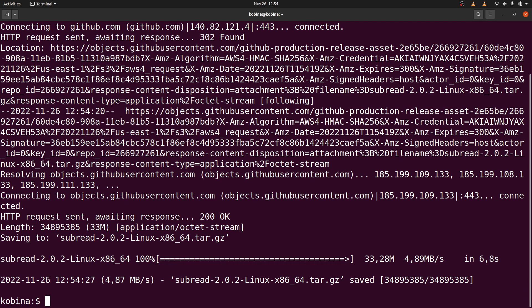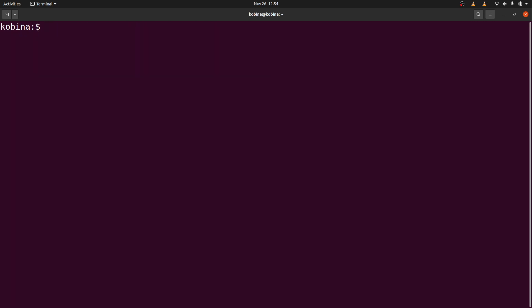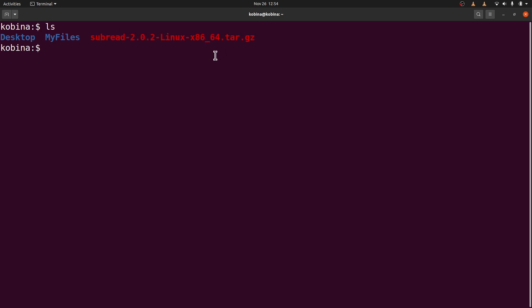Okay, so the file has been downloaded. Let's check it out. Let's do an ls and we will see this file here. It's a tar file. So what we have to do next is to extract the content of this tar file. I'll say tar, give the file name. Now execute this command.